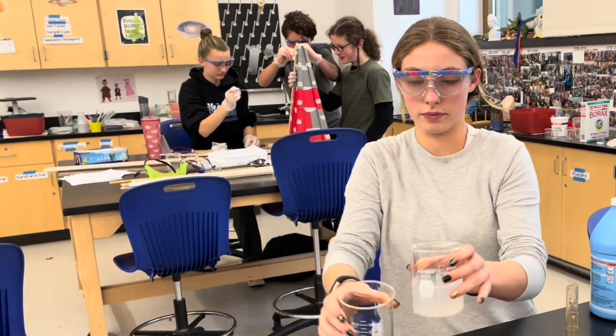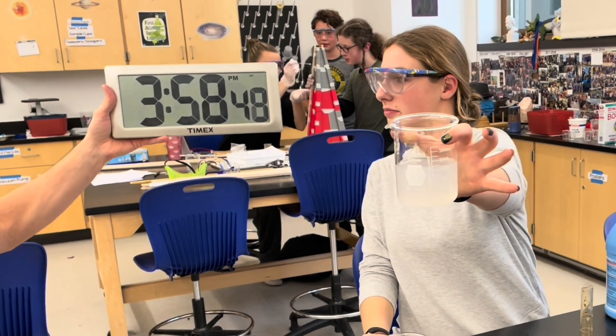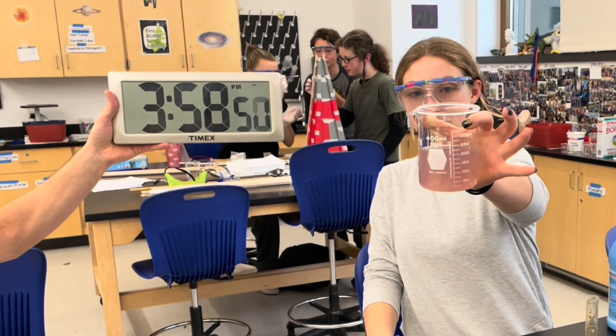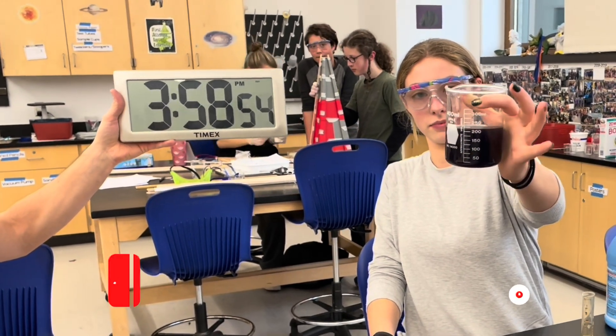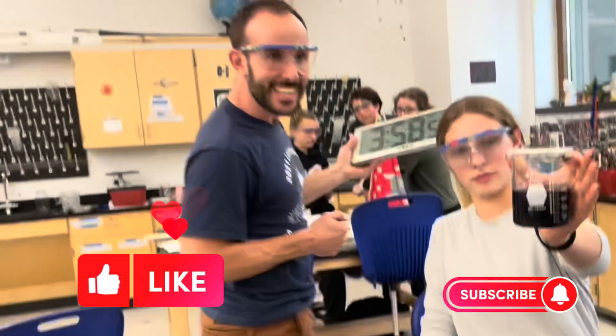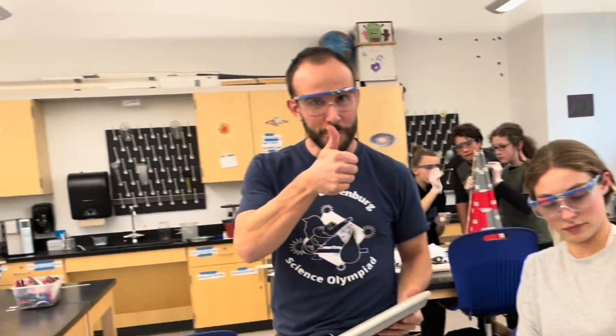Show the real time here, because people don't believe how fast this actually happens. So there you go — that is the iodine clock reaction. I hope you enjoyed it.